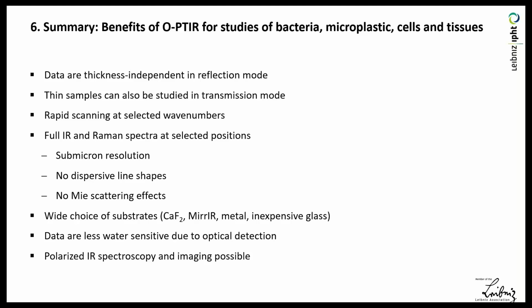So, thank you. Christopher, lovely presentation as always. I'm also interested in the cell line work that you did. If I understood it correctly, you took 5 spectra from each cell. Given the spatial heterogeneity in the spectra, how did you select where those 5 spectra came from? Because if you hit the nucleus or the cytoplasm or a lipid droplet within one cell, you can get huge differences in the spectrum. So how did you take 5 and average, how did that work?